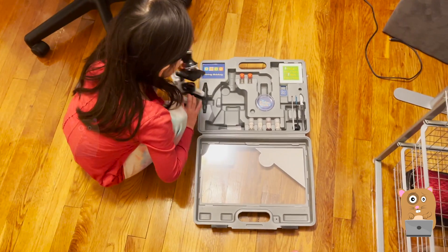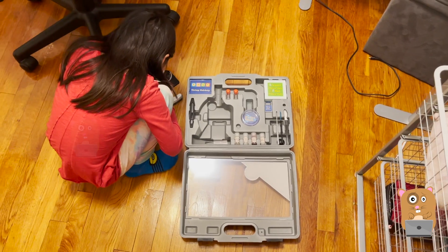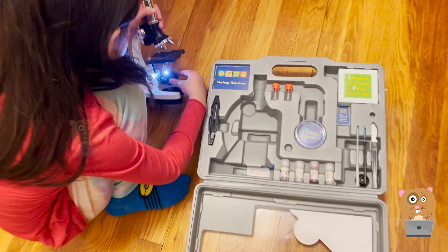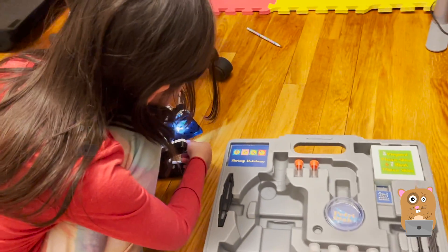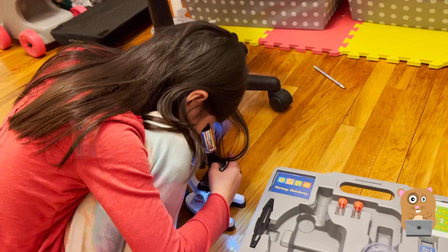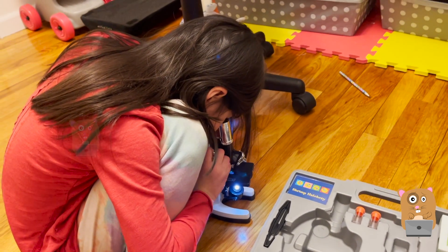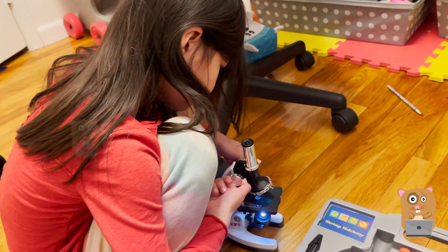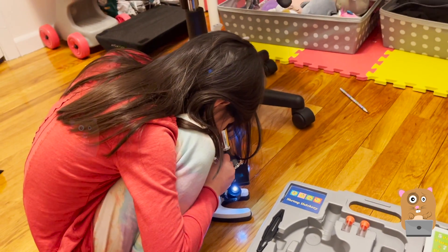I got this used for 15 bucks. I actually tried to order it before Christmas — ordered one from some website, but over two months it still hasn't arrived, so I'll cancel that order. Hopefully they'll refund me the money. The one I had ordered was like a digital one, like a macro camera. I thought that would have been better, but for macro cameras you can just use the iPad or my iPhone.